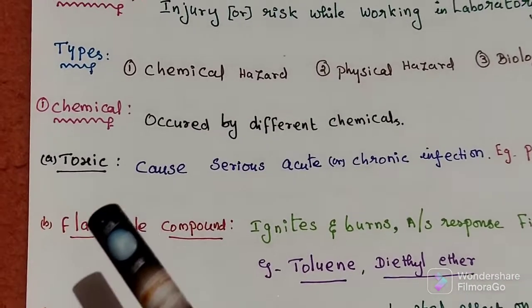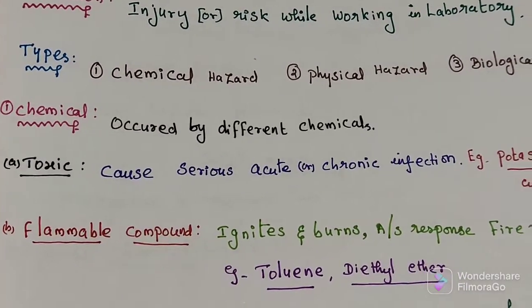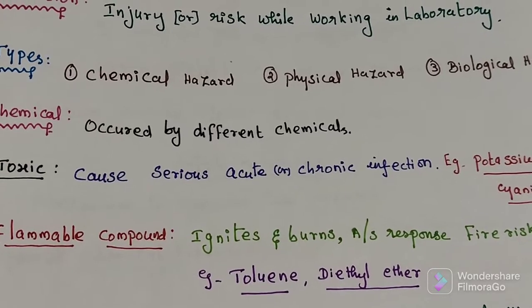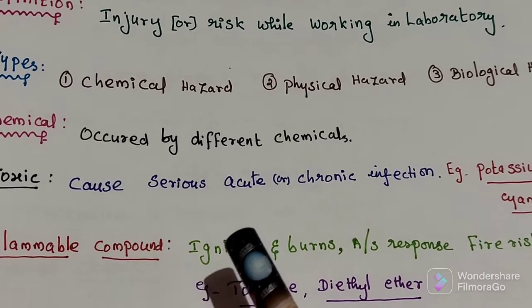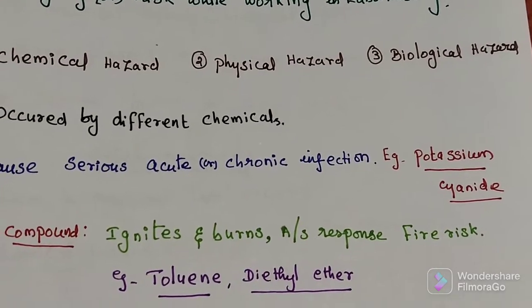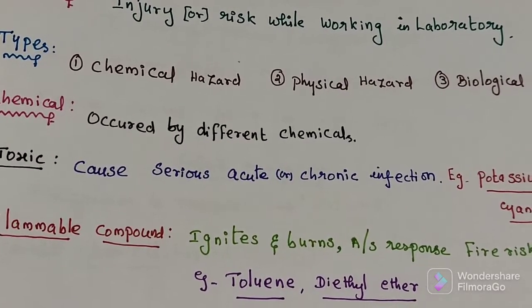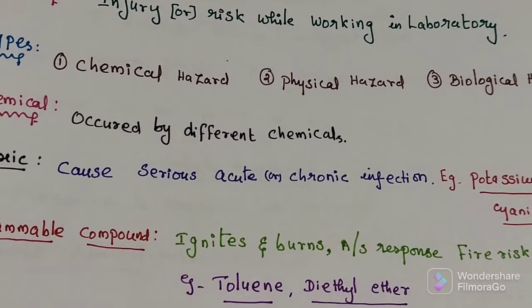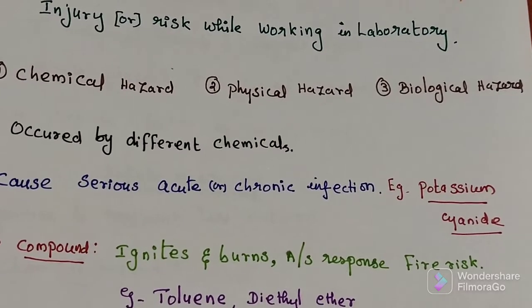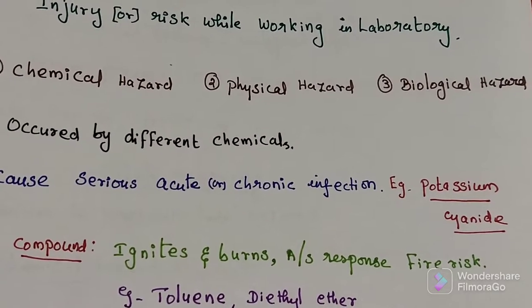The first type is toxic. A chemical which causes serious acute or chronic infection is called toxic. Example: potassium cyanide.